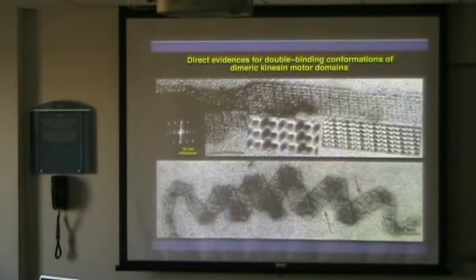That's about how the specimen looks. What we're looking at here, you're going to see a lot of microtubules. I'm sorry for that, because that's my field. So all microtubule-like kind of things. But this is a microtubule which is sort of flattened open. Basically, if you take the tube and unflatten the wall to a two-dimensional sheet. And that's a typical image in negative staining.